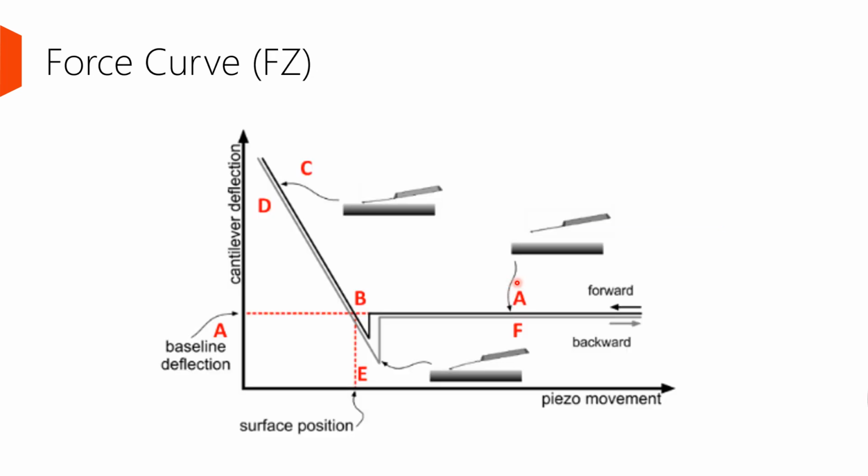So after we've done our homework to select the proper cantilever and the proper tip, we can move on to do some force curves. Basically, the cantilever starts somewhere away from the sample surface, moving along the z-axis and making contact with the sample. After some set point, the force is being unloaded and we get some adhesion in here. After the maximum adhesion is ruptured, the cantilever goes back to the baseline position. During the whole process, the deflection of the cantilever is being recorded.